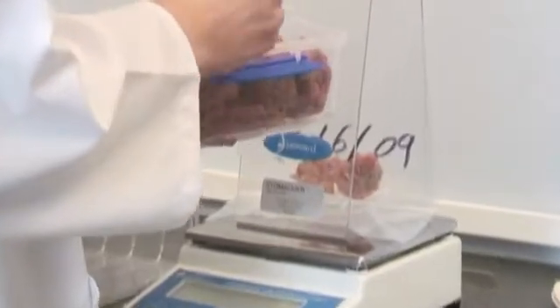The Stomacher is easy to use, durable and reliable. It allows for easy and effective processing of multiple samples without the risk of cross-contamination.